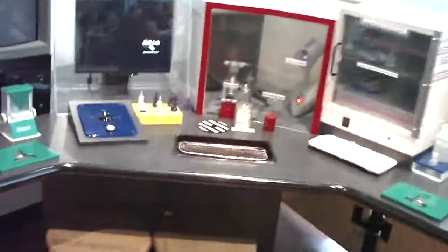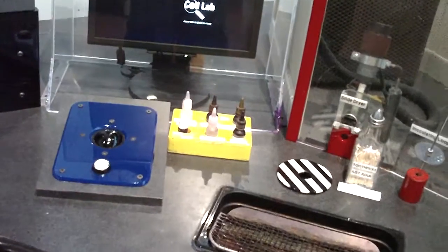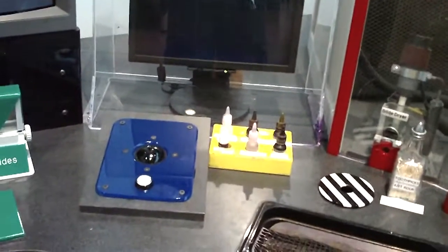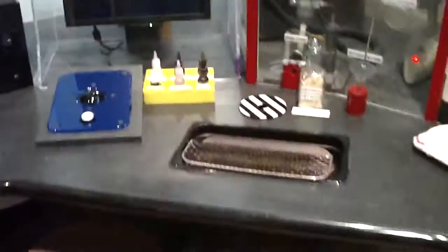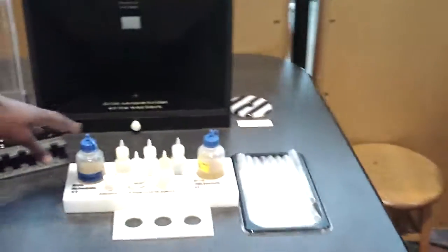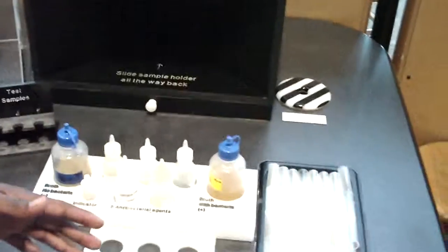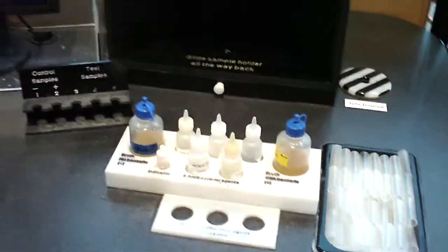This bench here is mystery microbes where you find different bacteria that's in the body like E. coli, staph, and different anaerobic bacteria. It's bacteria against bacteria to see which cleaning supplies work the best for getting rid of bacteria.